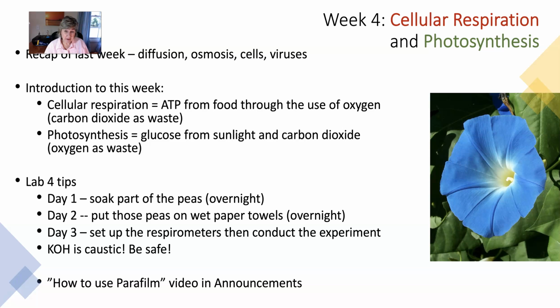For me, I found that 20 minutes was too long because all my respiration happened within the first, say, 10 minutes. So you may find that too, but that's okay. Just see what you get and stop the experiment when you can't read one of the tubes any longer.